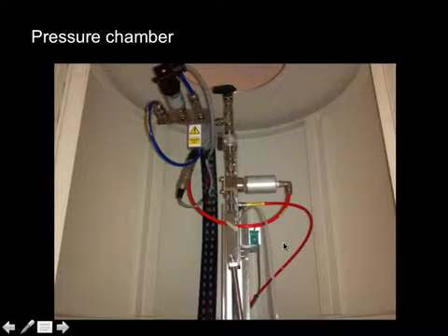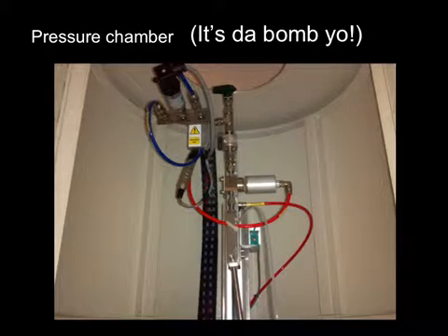So, okay, we talked about the innards of basically the DNP apparatus. Let's focus a little bit on the dissolution part. So the pressure chamber, which you've all seen, and I think probably you guys have seen this all over the past couple of weeks when you've gone in the lab, but it's helpful to really talk about it explicitly. I think up here there's the pressure chamber, or also known as the bomb. It's the bomb, yo.